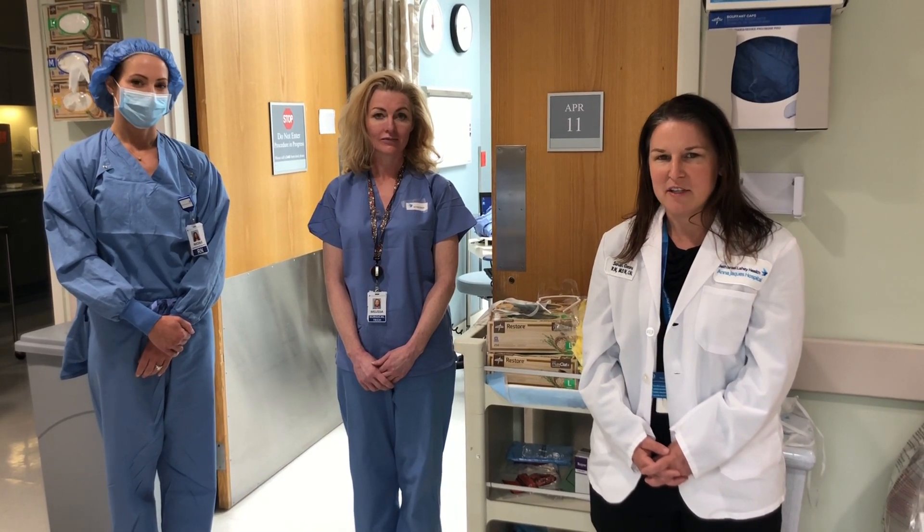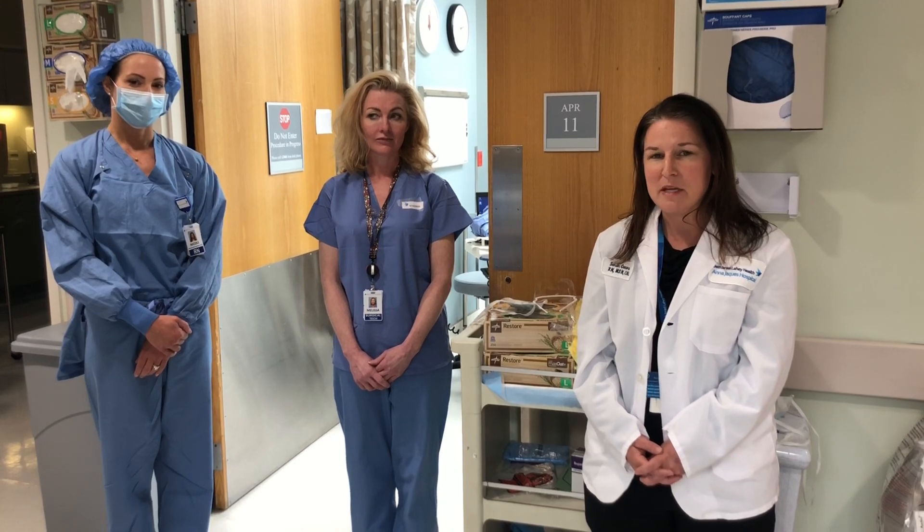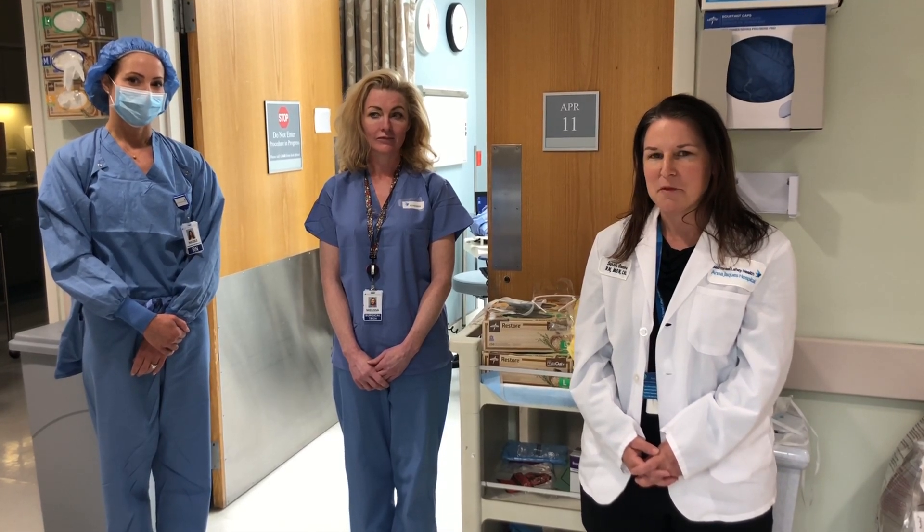So what we're going to show you today is just the appropriate procedure for donning and doffing of PPE in the most simplest form.